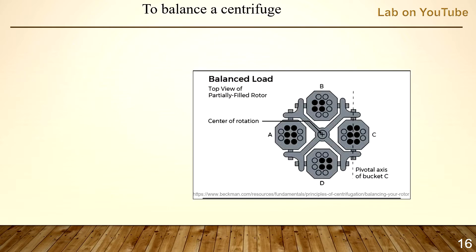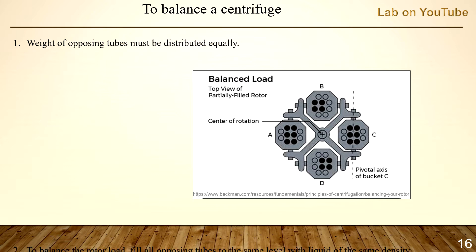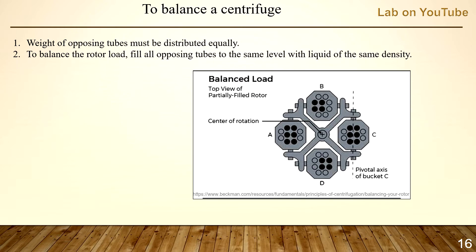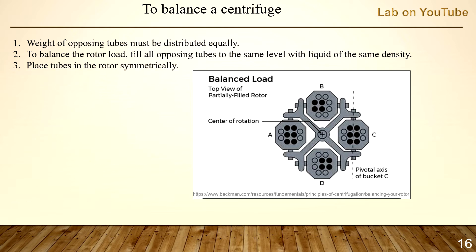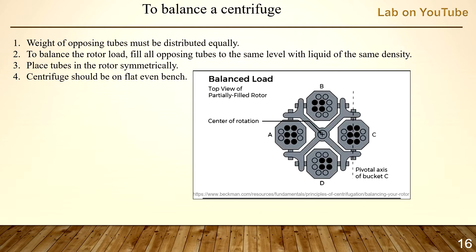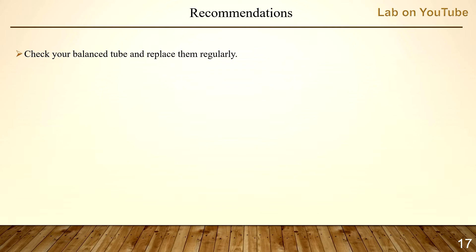To balance a centrifuge: first, weight of opposing tubes must be distributed equally. Second, to balance the rotor load, fill all opposing tubes to the same level with liquid of the same density. Third, place tubes in the rotor symmetrically. Fourth, the centrifuge should be on a flat, even bench. As a recommendation, check your balance tubes regularly and replace them after a certain number of spins.